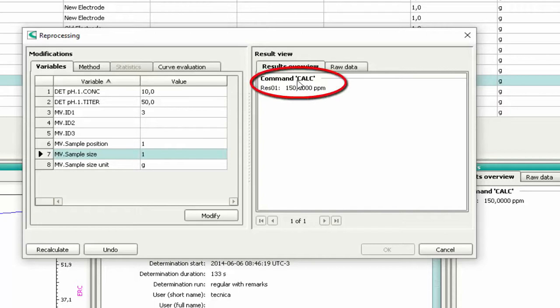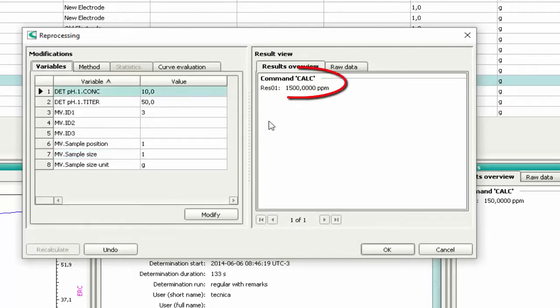This is the result before the recalculation. Now press the button Recalculate. You can see that the result was changed.